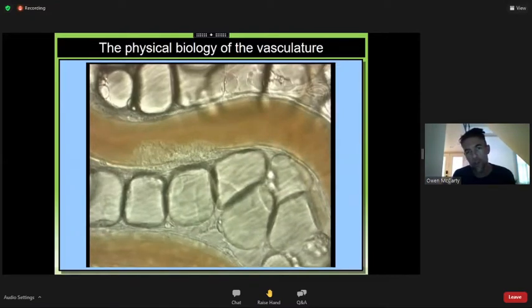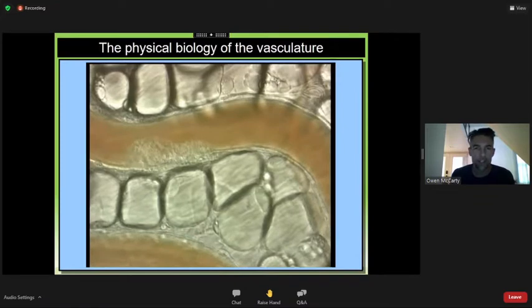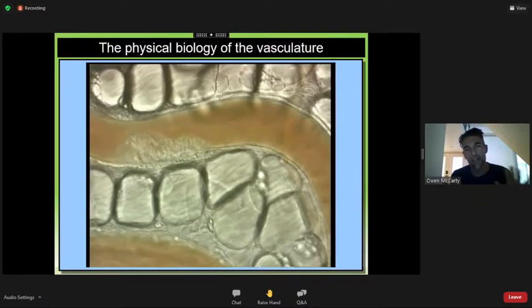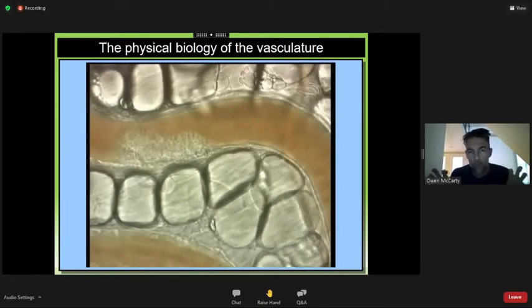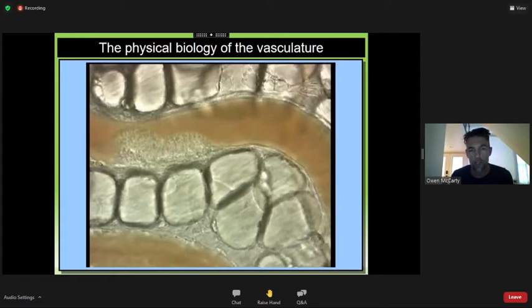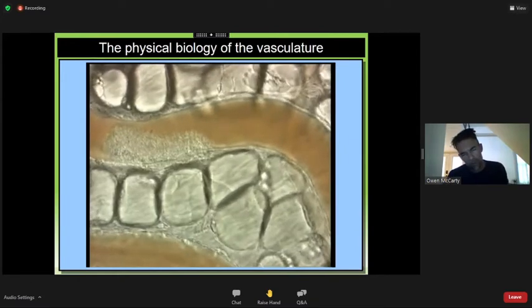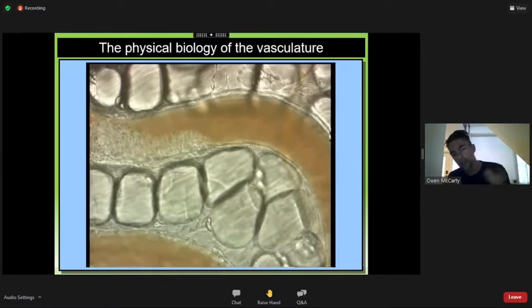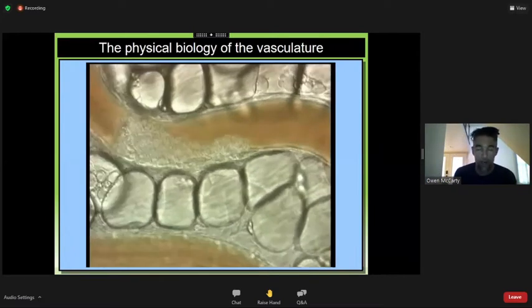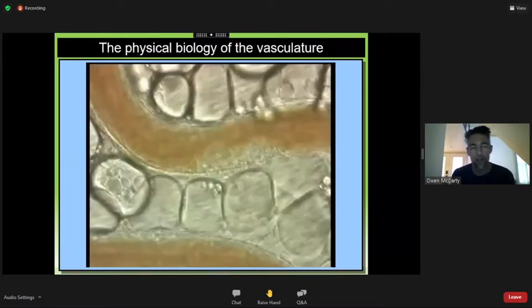It probably flows a little smoother in life than it does on our glitchy video, but we get the idea that blood is perfusing through a vessel here. The middle, those big cells, are structural cells. Those are very fat cells. The bottom part is a vein. That's the drainage, so all the blood is coming back toward the heart. The top part is blood pumping away from the heart, and the bottom part is a vein with blood returning.